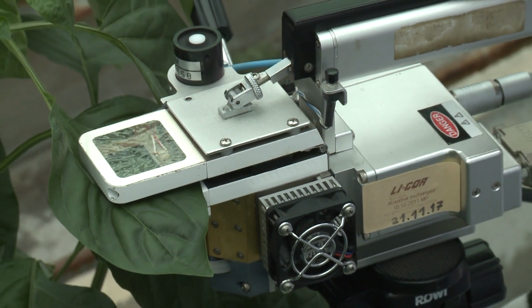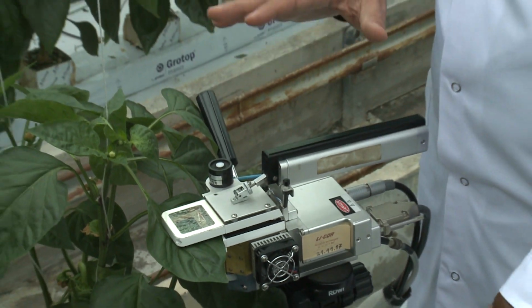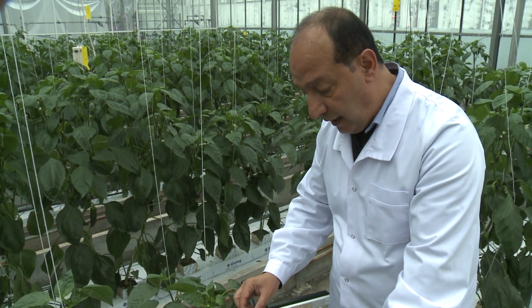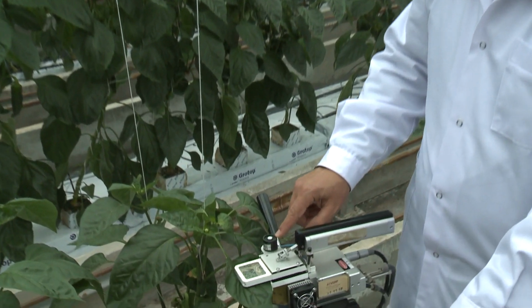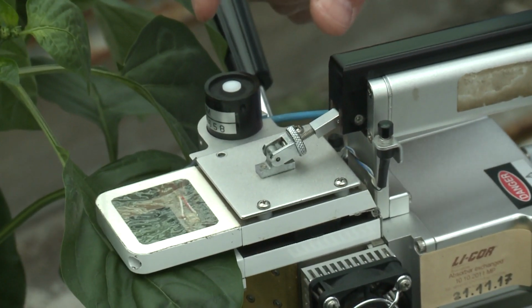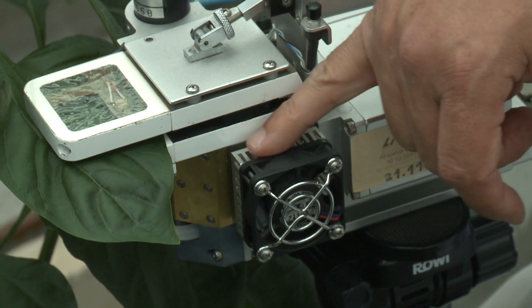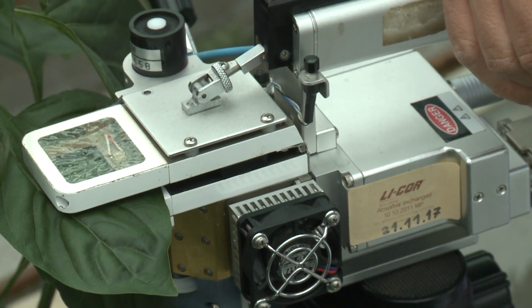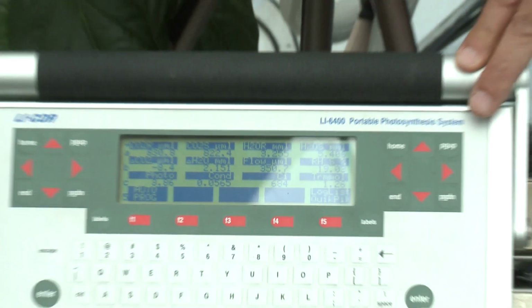Now coming back to the second part of our instruments, as we said, we call it the cuvette. The cuvette is usually like a small growth chamber, and it's equipped with a light meter, as we explained at the beginning of our presentation today, which is measuring the light intensity in the range of 400 to 700 nanometers. Then we have the ability to control the temperature, increasing or decreasing by Peltier elements. Then we have the ability as well to control the humidity here electronically, and the carbon dioxide inside the chamber as well, if I'm not using the ambient carbon dioxide from outside.